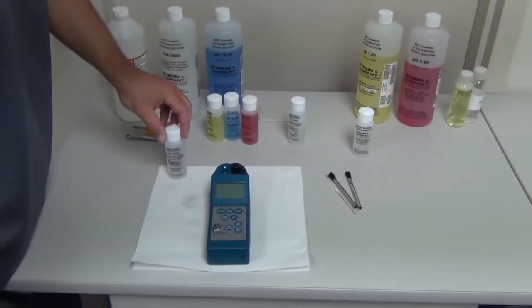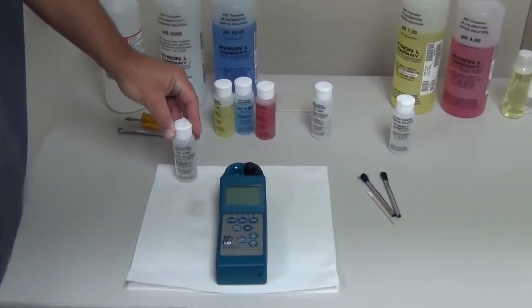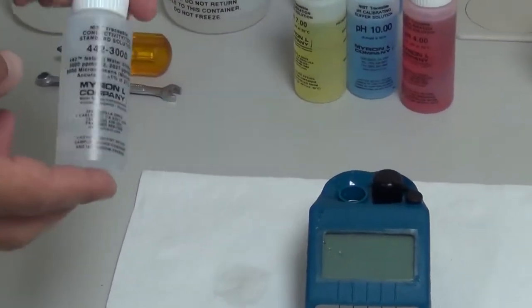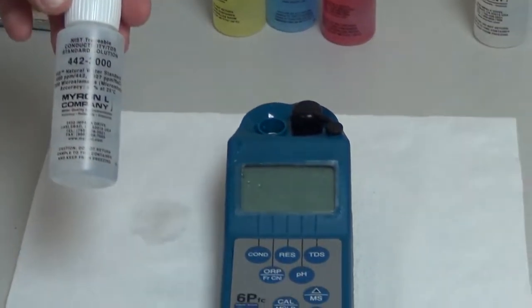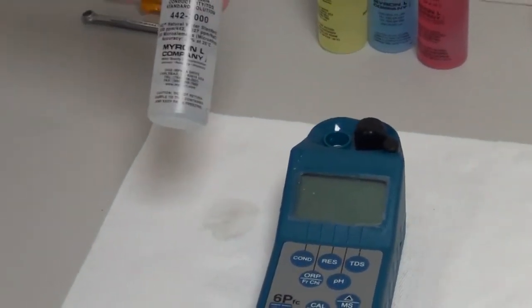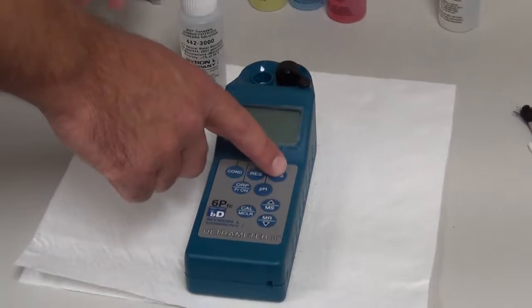All right, we will now move on to calibrating the TDS function. TDS uses a 442 solution. The factory recommended solution is 442 3000, so I should get a reading of 3000 ppm. That is what I'll use. The method for calibrating is the same as it was with the conductivity.